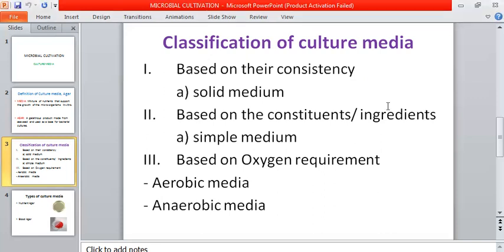You put the Petri plate in which you have inoculated the microorganisms, and then they can grow. And we discussed previously that bacteria can grow within 24 hours. They multiply, and we can see colonies or this particular growth clearly on the Petri plate within 24 hours.